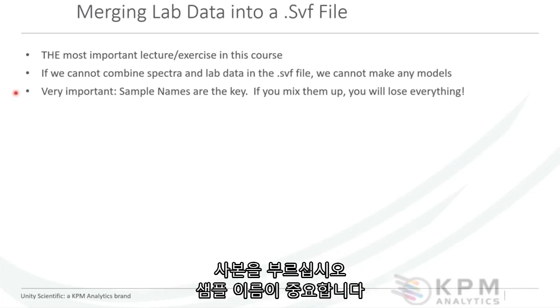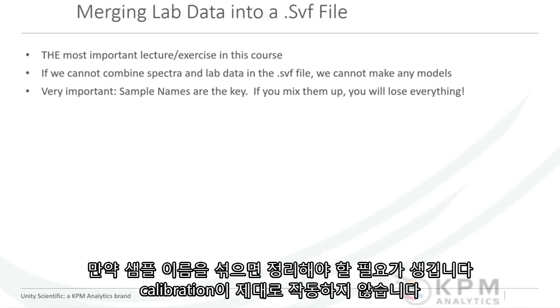So just a caveat here or a note, sample names are the key. If you mix them up, you will have a bookkeeping mess that you will need to clean up, or else your calibrations will not work very well.